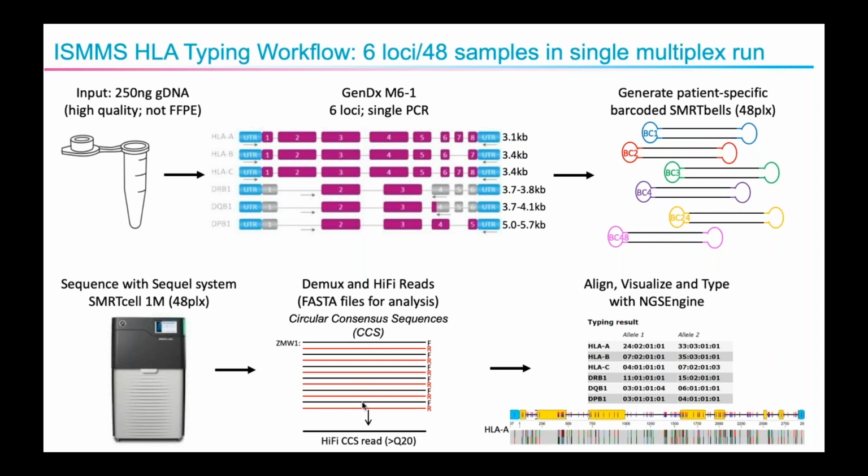So again, multiple passes are combined into a highly accurate intramolecular consensus. And then using the NGS engine software, these FASTA files are used to align, visualize, and HLA type the loci, with the mapping of discrete SNPs visualized in this image.